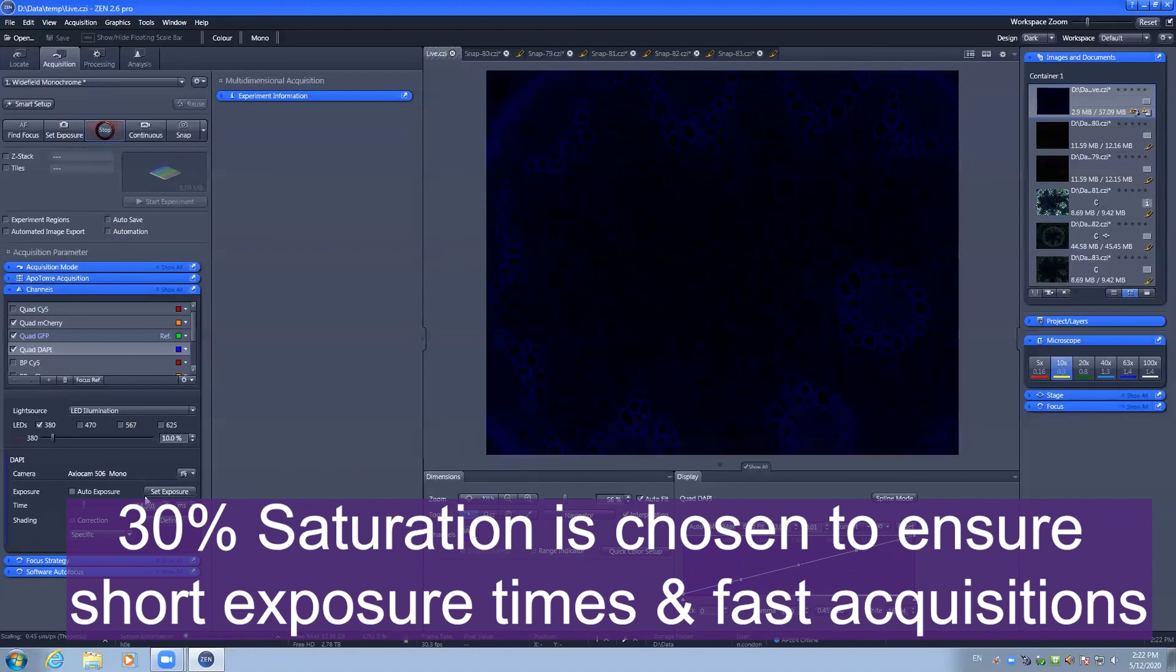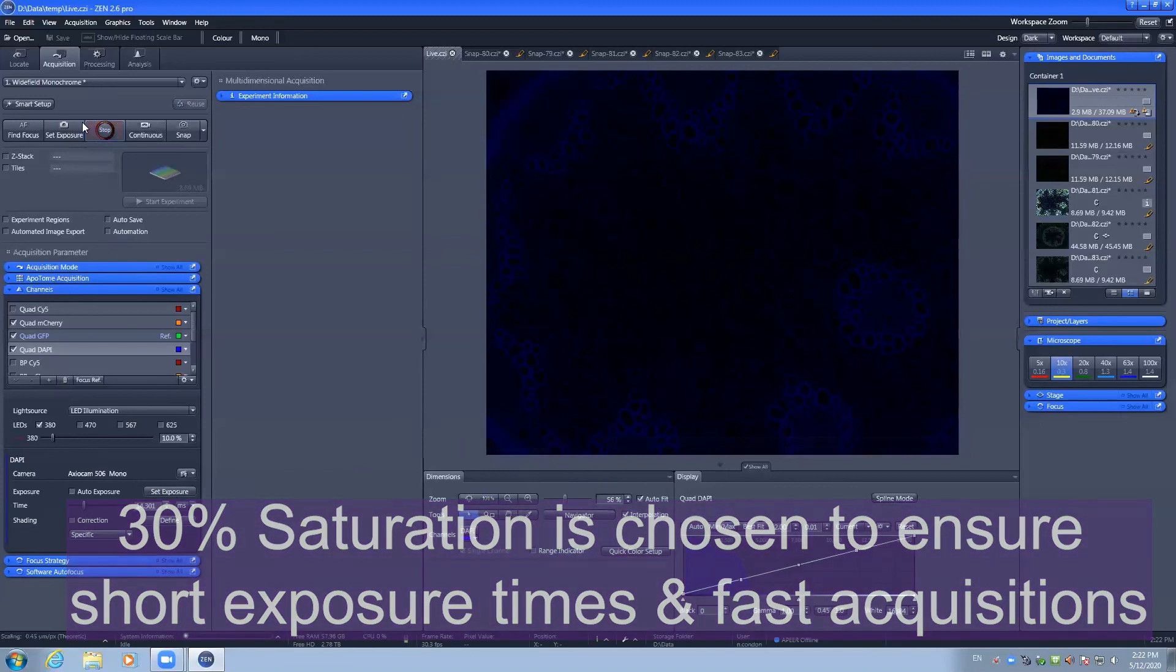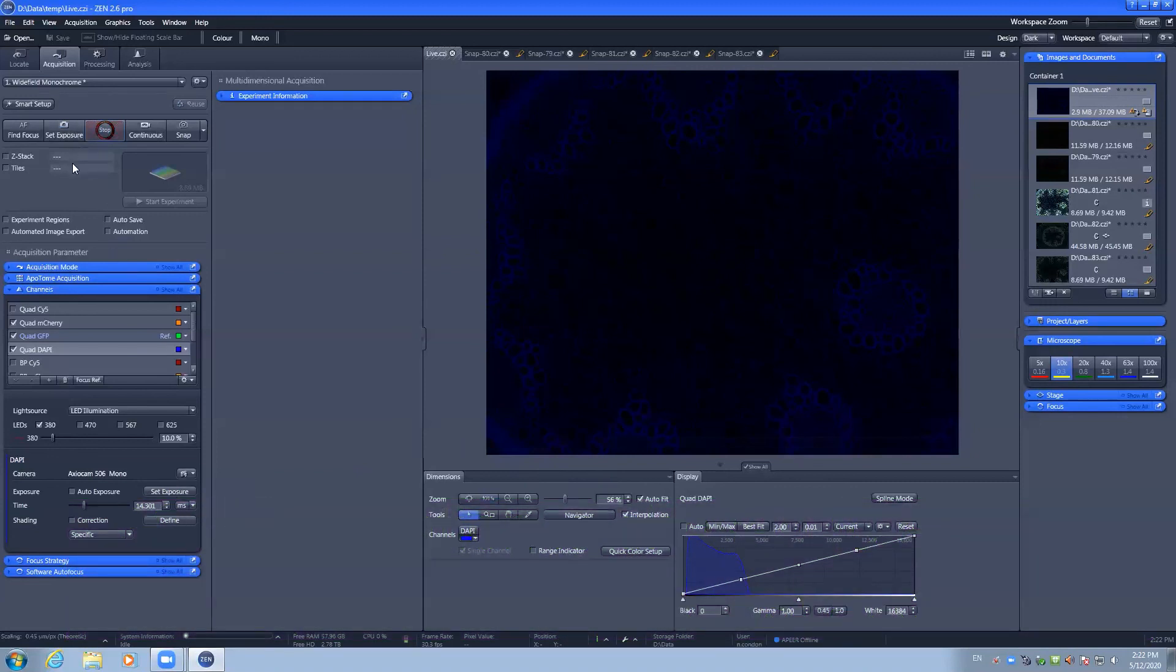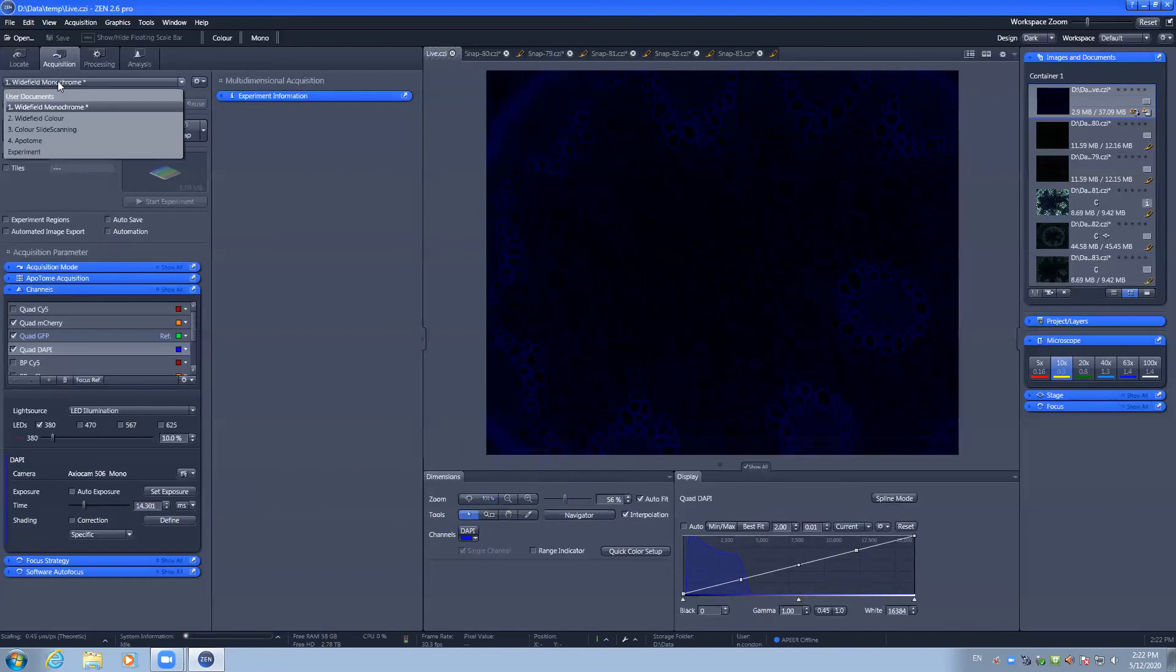The set exposure also has different settings for Apertone mode versus wide field monochrome mode. And you should ensure that you are in the correct experiment mode.